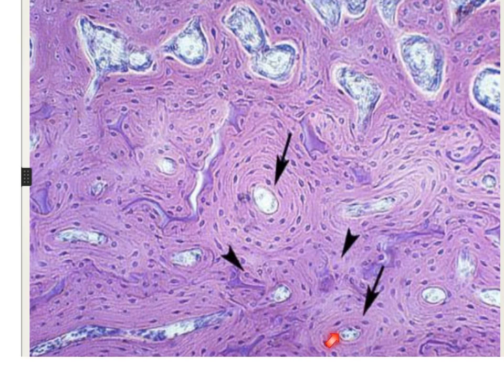Here we have the concentric bony lamellae, and the blue dots here are the osteocytes in their lacunae, or osteocytes alone, because lacunae cannot be seen in this section, which is decalcified. Here we have the blood vessels also, here and there. All these are blood vessels, and you can see that they are anastomosing. We have an anastomosing vessel arising from this one to join a neighboring Haversian blood vessel.